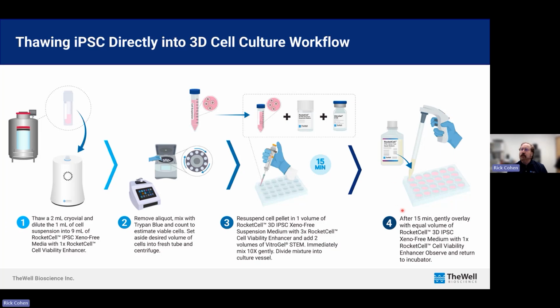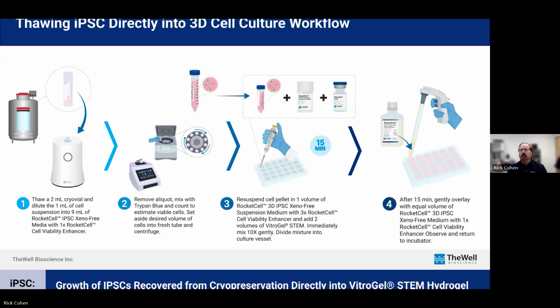If you use an IncuSite or similar, you can put it directly in there. If we were using a 2D plating, I've tried putting it in the IncuSite right away, but the vibrations cause problems with plating, and you can't do that. So with a 3D system, you can observe it immediately.